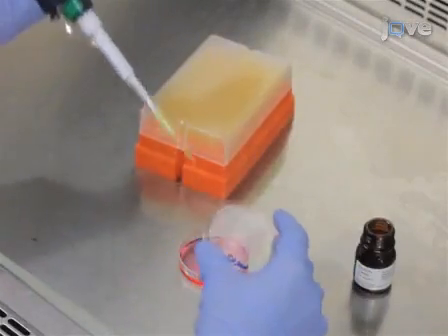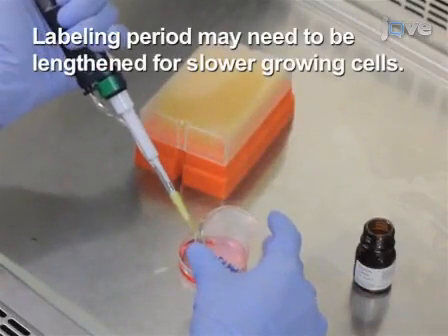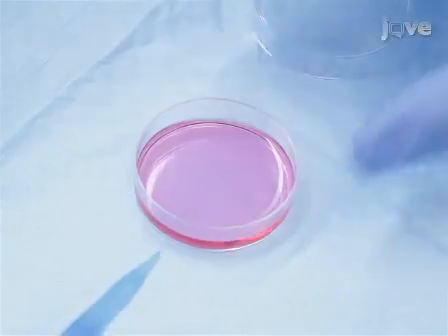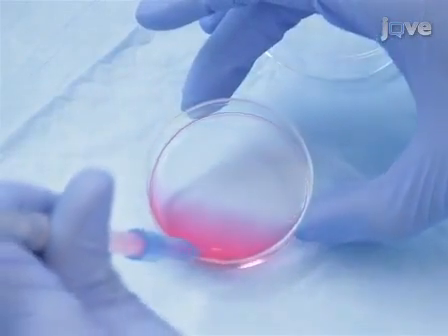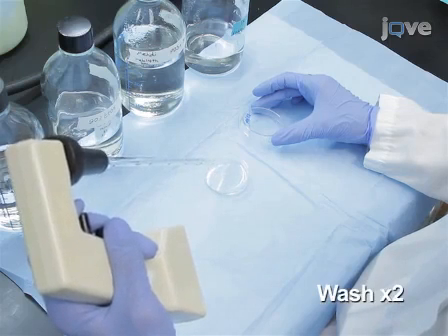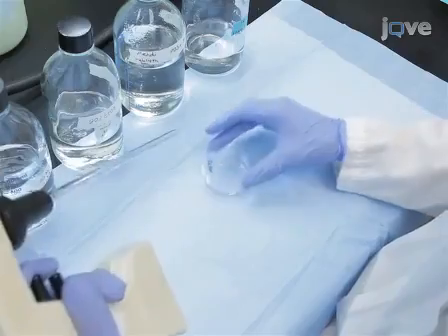Add BrdU at a 1:1000 dilution to the experimental cell cultures. Incubate for 1 hour. To harvest the cells, aspirate the culture medium and then wash the cells thoroughly with PBS 2 times to remove all traces of medium.